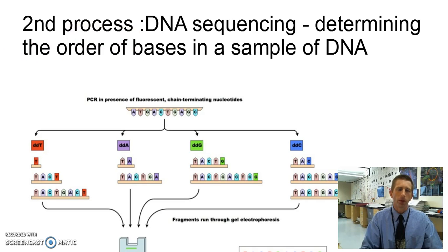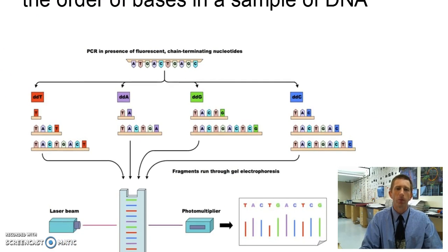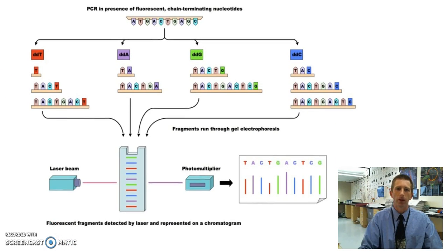But we know that even if we use the most powerful microscope in the world, we can just barely see a double helix of DNA. And even if we could see the individual nucleotides, it's not like they're conveniently labeled for us. They're just atoms and molecules. So how do we determine the sequence of A's and T's and C's and G's?